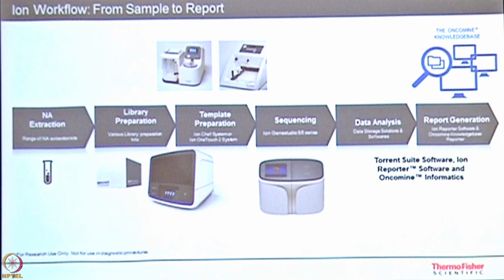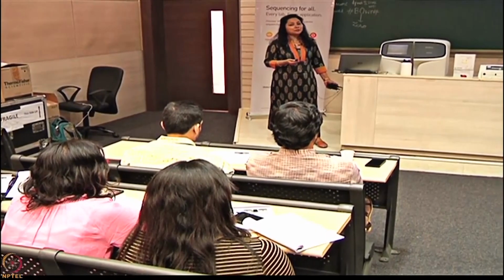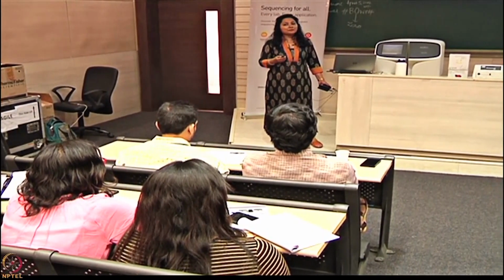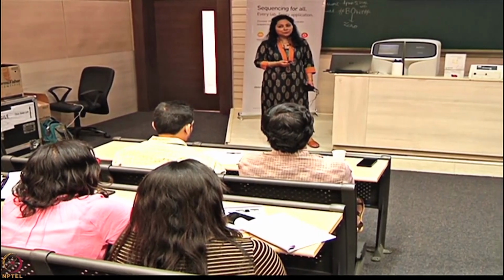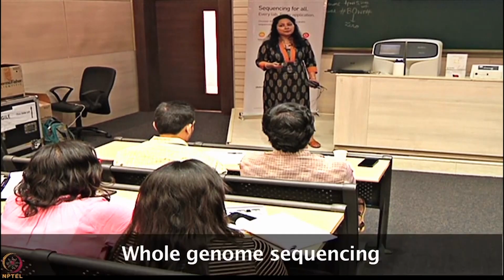Coming to the workflow now, how we are generating these millions of reads. You start with nucleic acid, which can be DNA or RNA. Where do you think you would be starting with DNA? What kind of experiments would you do on NGS with DNA as a sample?